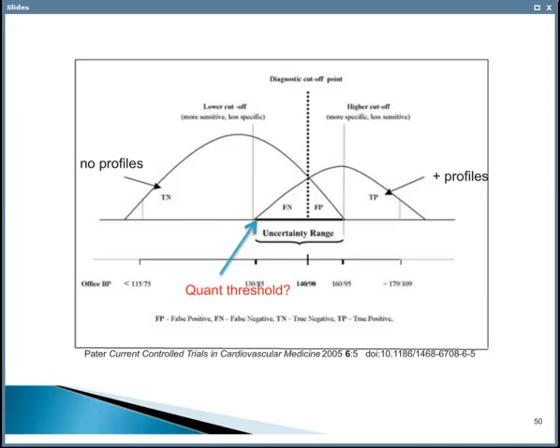Now, I recommend that labs wishing to use this system evaluate it and decide what the threshold would be for themselves. 0.002 seems reasonable, or slightly less, but you can use the undetectable quantity as well. I would advise labs to evaluate in their own hands, because they may be using slightly different amp cycles and different conditions, but I firmly believe that this system allows one to have a quant threshold that you can use to make decisions.